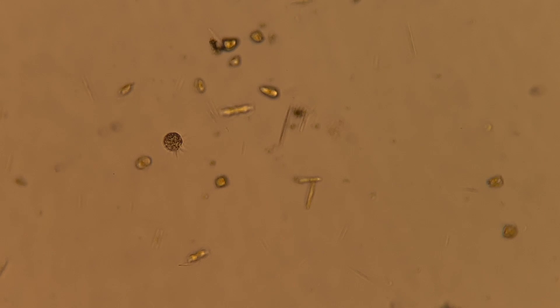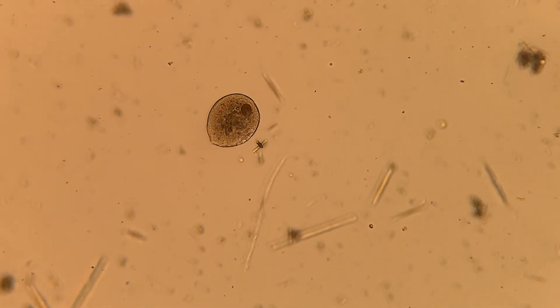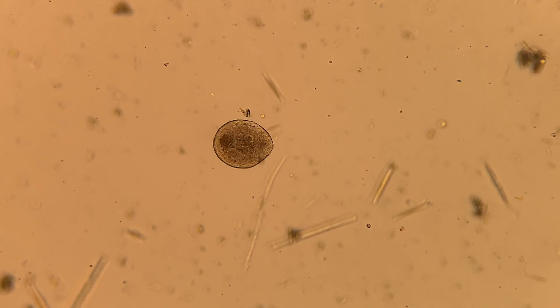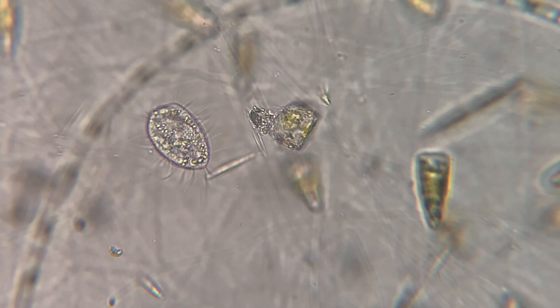Here are a couple of small things that I wasn't able to identify just offhand. I do have a reference book that I'm going to take a look at and I'll probably post what I think it is in the comments. If any of you guys are microbe or protist experts and you know what it is, go ahead and put it in the comments and let me know.